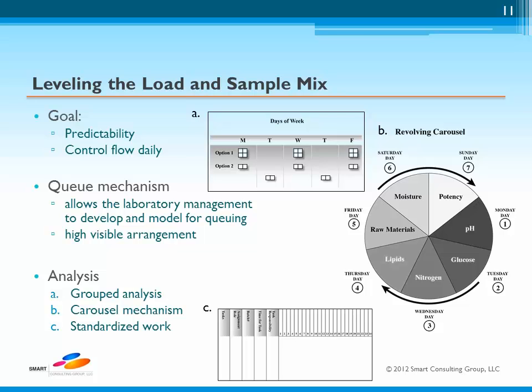Having a constant delivery for the bulk of the incoming samples means that the various analyses can be appropriately spaced in time to stations, and this allows capacity to be fully utilized and staff resources to be maximized for operational efficiency. The real bonus here is that the samples will be tested, analyzed, reported, and decisions enacted upon based on that data on a regular, clockwise repeating basis that enhances the reliability of the data. Both mechanisms work on a principle that revolves around a defined starting date when the analysis is required to begin. If this does not happen, then the model will not operate effectively.